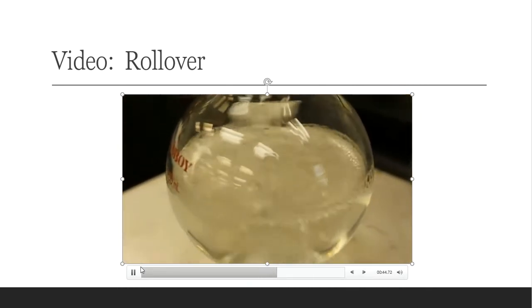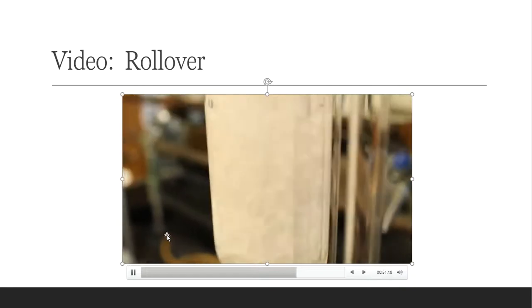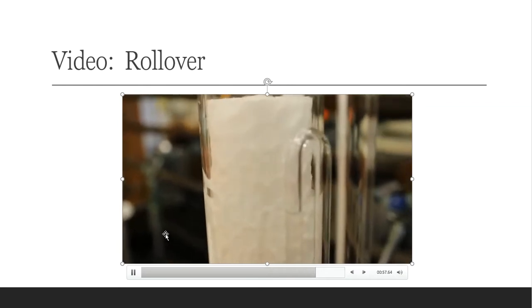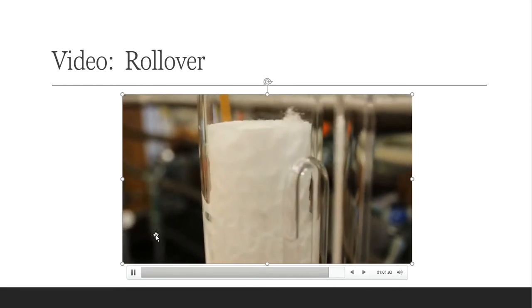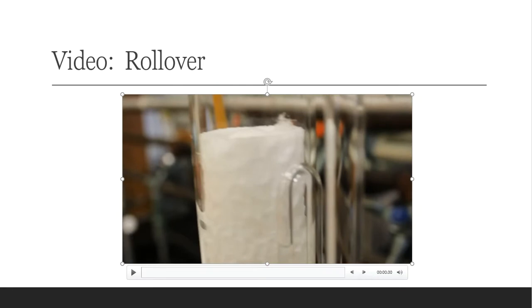All right, so I'm going to continue to let this go. This is what we call a rollover. When that liquid, the solvent, gets up to the curvature piece and drains, that is called a rollover. I'm going to record a couple of rollover times. How long is this process actually taking? It's an important part of the lab book, and I can't forget about it.